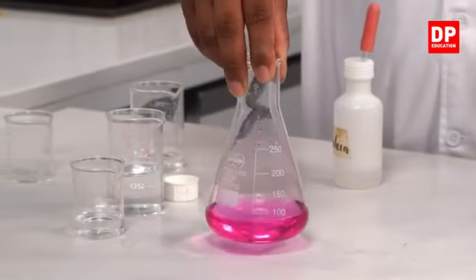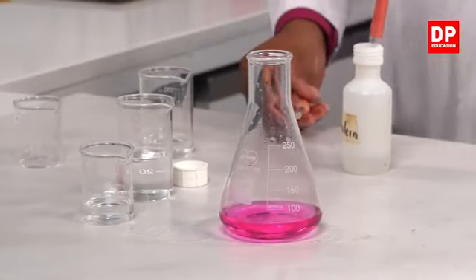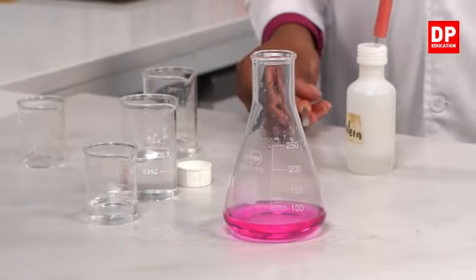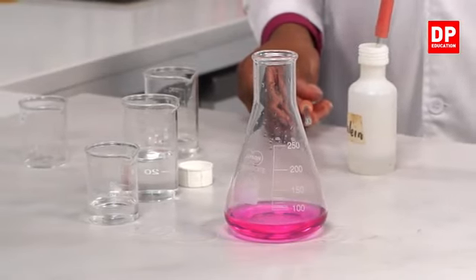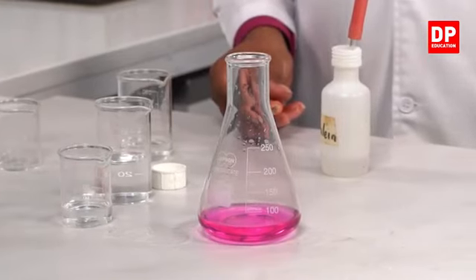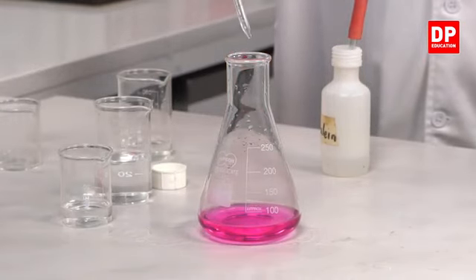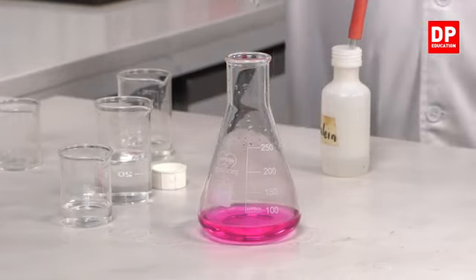See, you can observe now the color has decreased dramatically. Earlier it had a good pink color, but now it has very little pink color. We'll add another drop and we'll mix it.